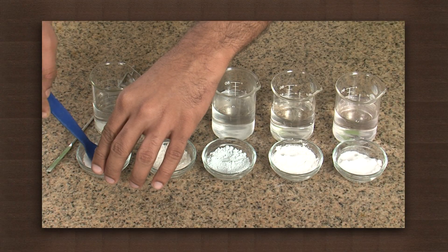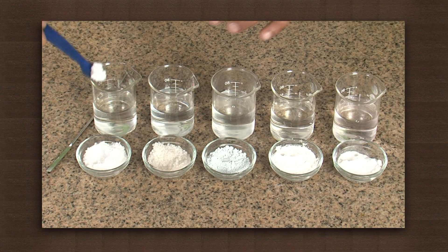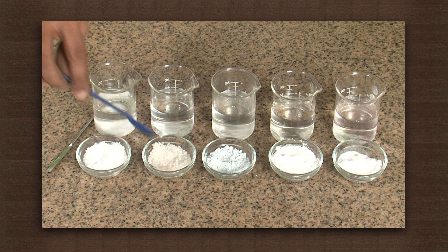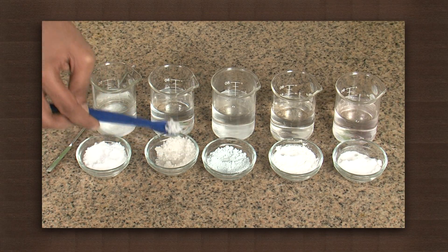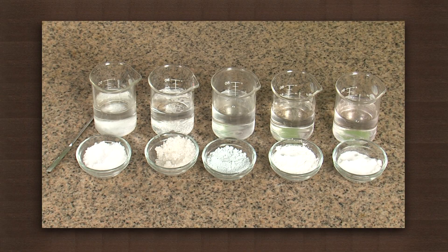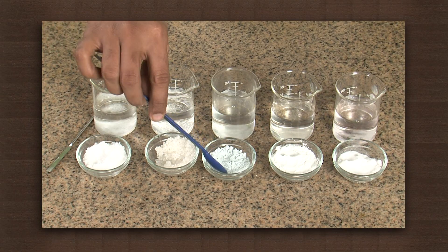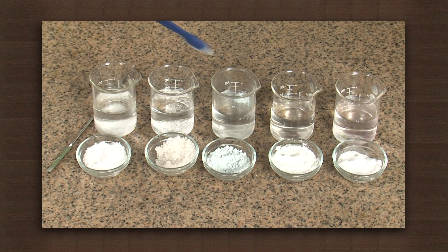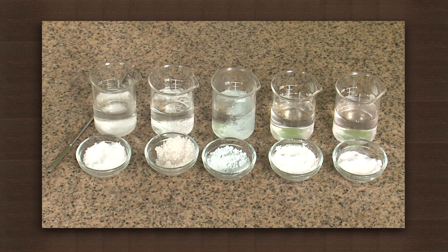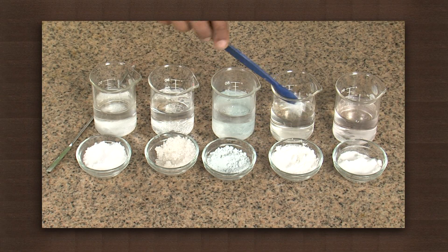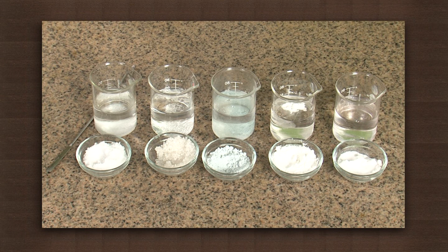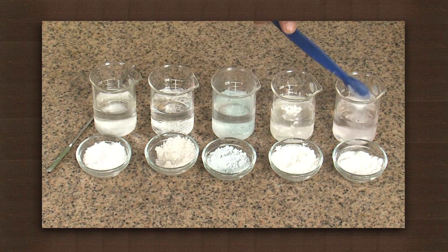Now add equal quantities of each substance into the beakers. Stir them and note which of the substances have dissolved in water and which have not.